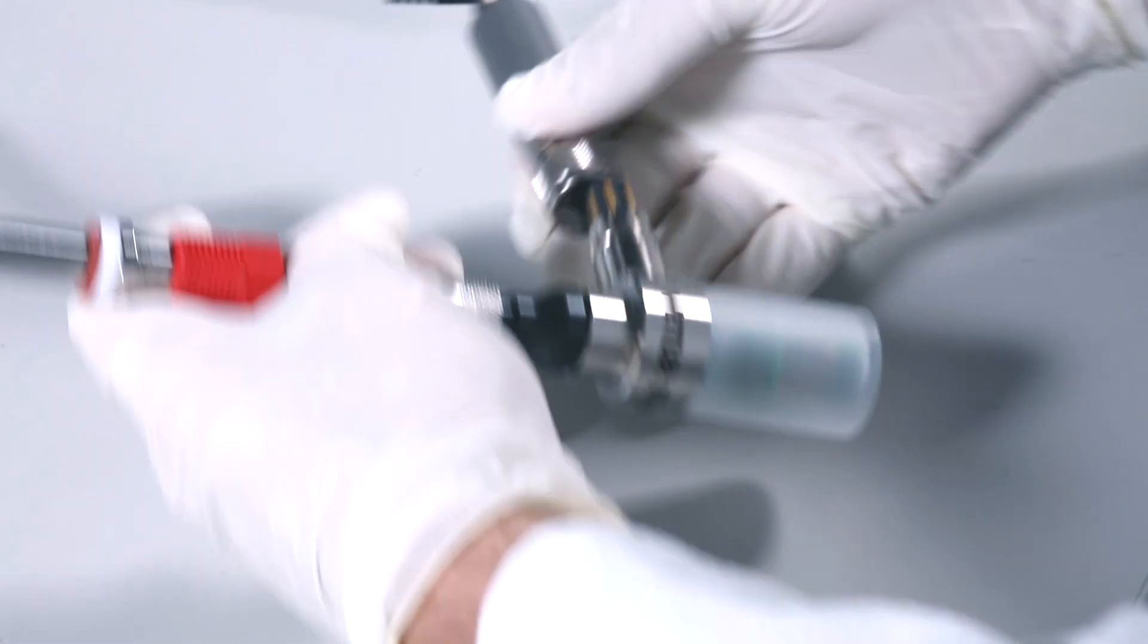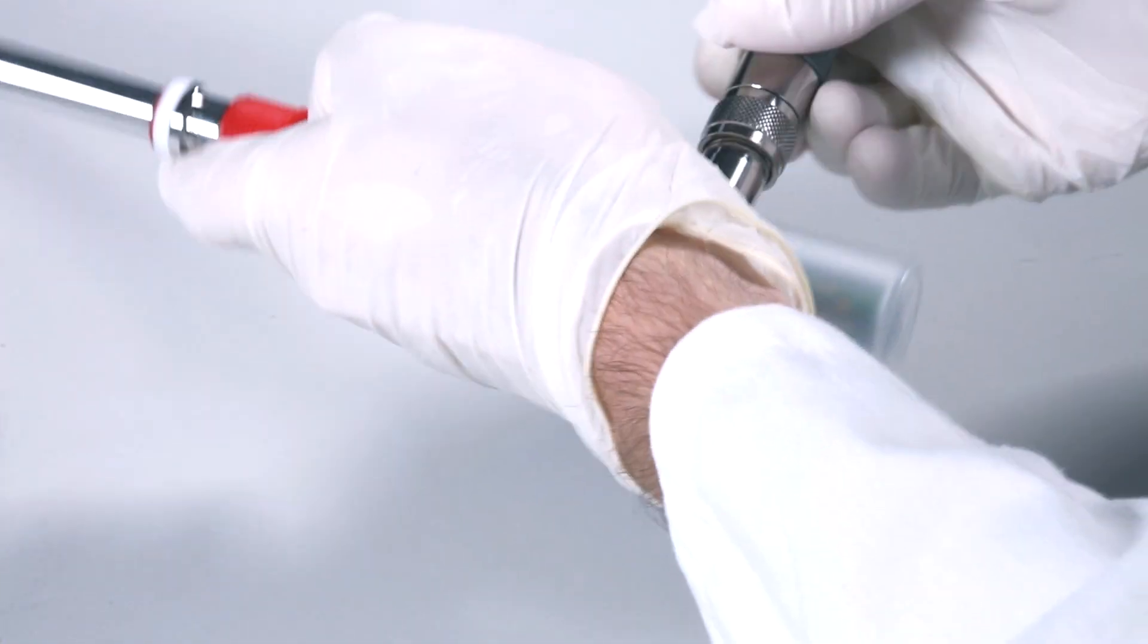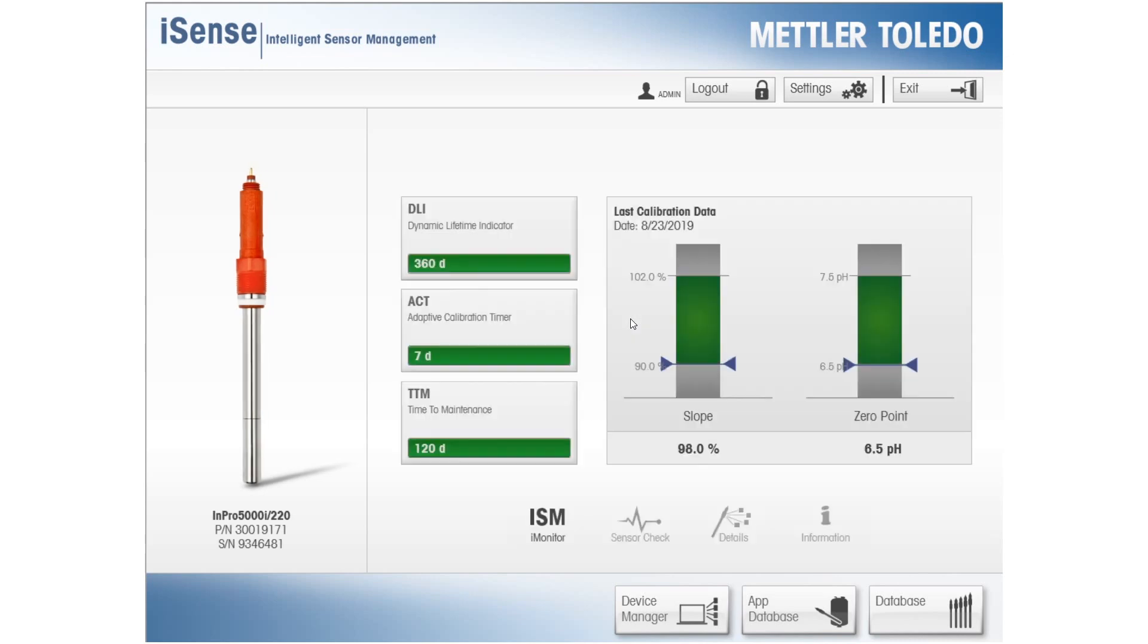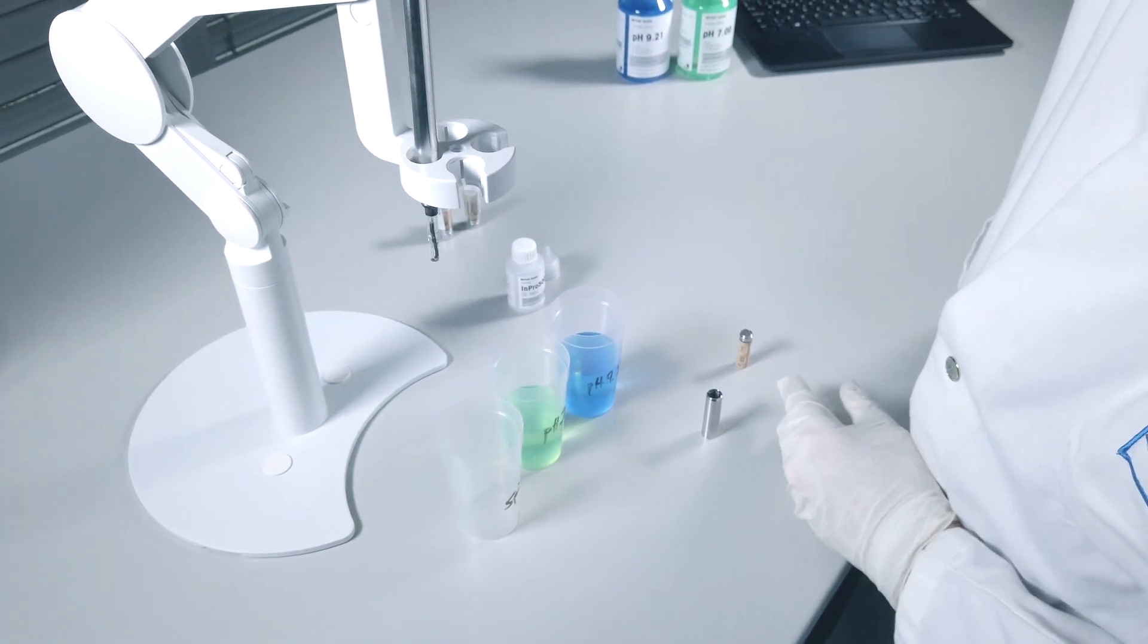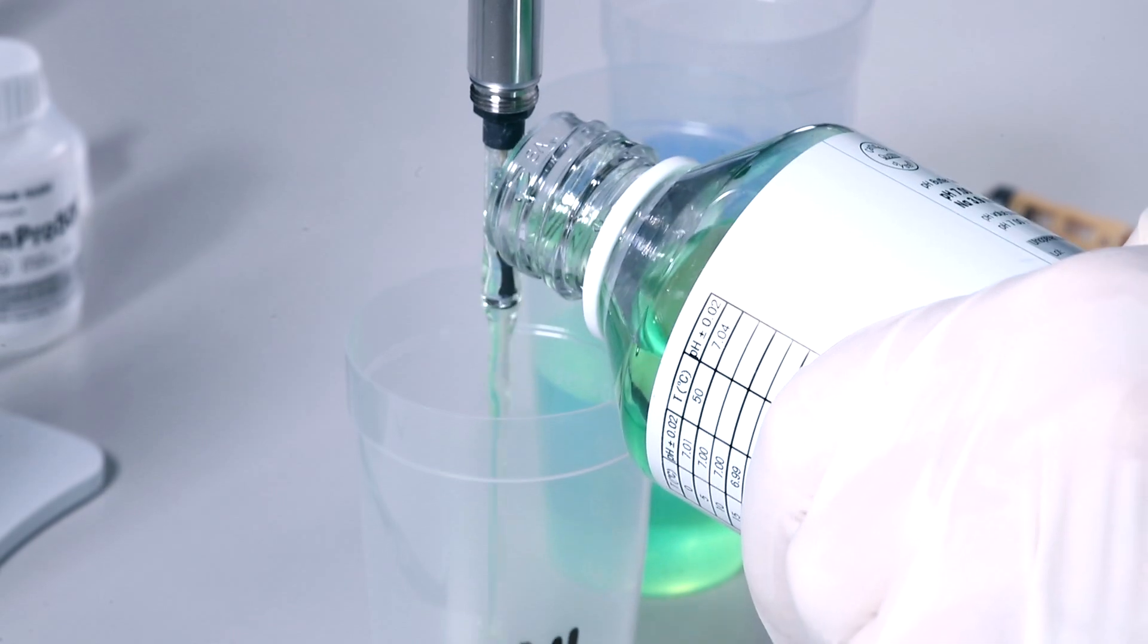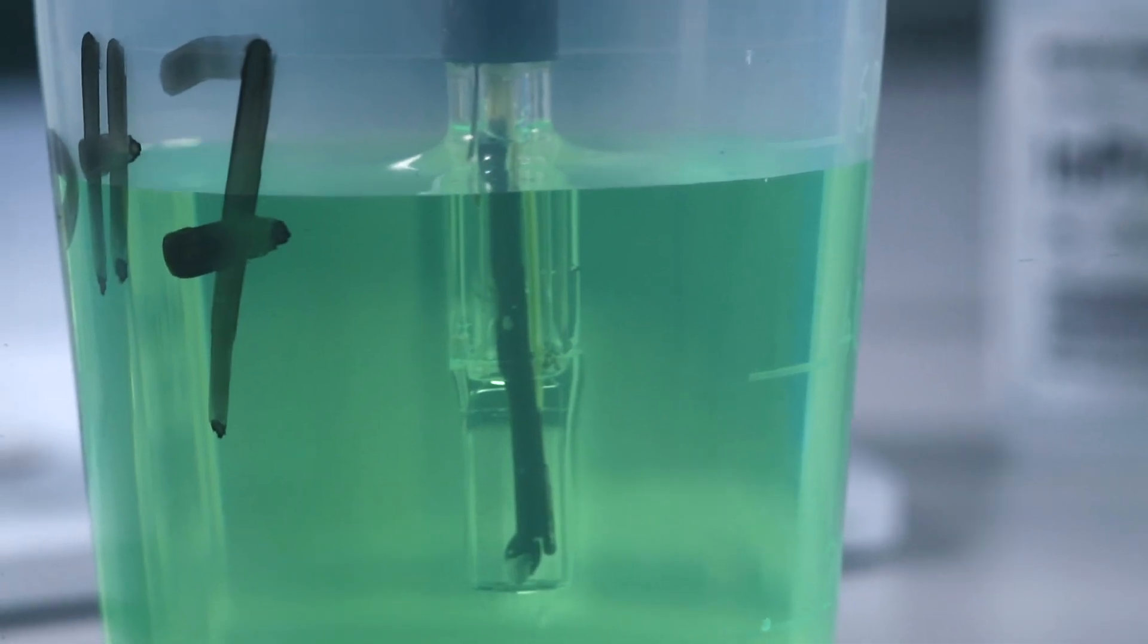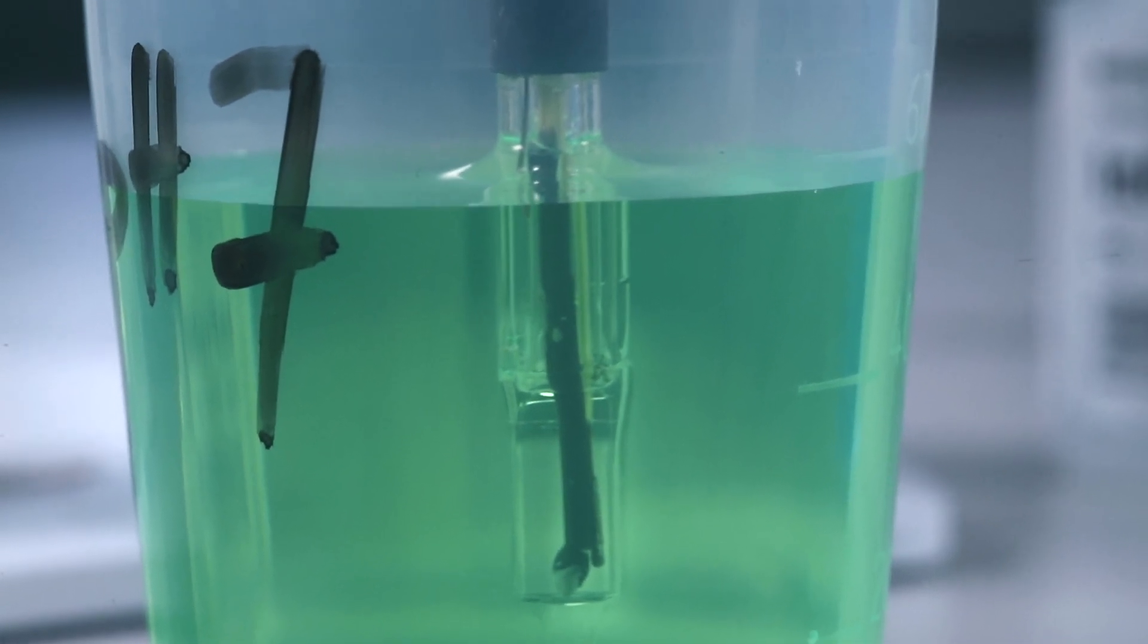Connect the sensor to iSense to evaluate the slope of the pH probe. As a golden rule, rinse the probe in the same buffer you intend to use for the next calibration step. Before proceeding, we recommend as best practice to condition the pH probe for 10 minutes in buffer 7.